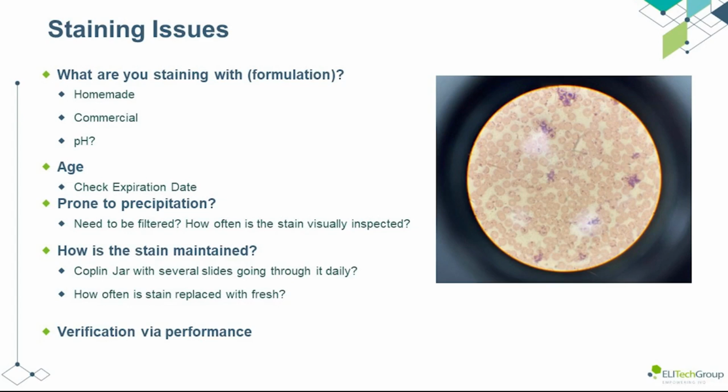Don't forget that these stains will sometimes require mixing with a buffer, so it's ultimately the pH of the final staining solution we need to check, not the stock solutions. As with most dyes, these stains eventually degrade once mixed with methanol or water, so it's important to keep an eye on the expiration date.